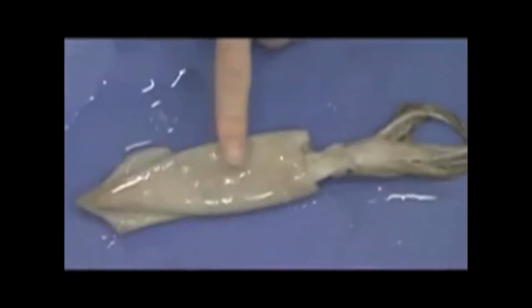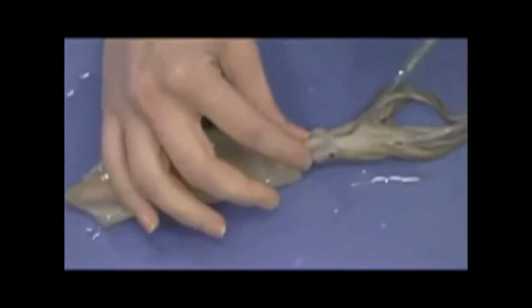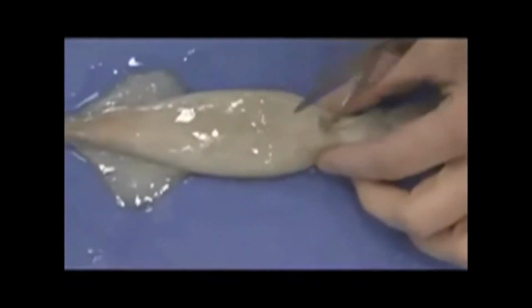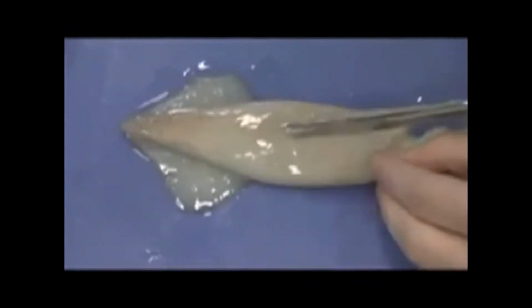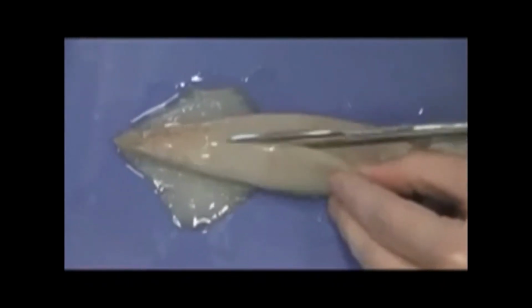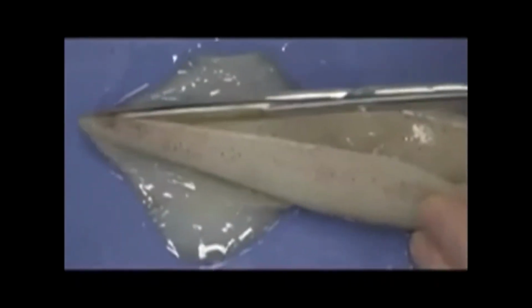And you can see in the image that the teacher, I guess, turned over the squid to the dorsal side, and she's using a probe to show you the siphon. So you can see the inside, the mantle where the water would go in, and there's the siphon where the water would come out. And when you do your dissection, look carefully at this video and at the PowerPoint. Make sure the tips of the scissors are pointing up away from the organs, like you see in this video, because you don't want to accidentally puncture any of the organs.